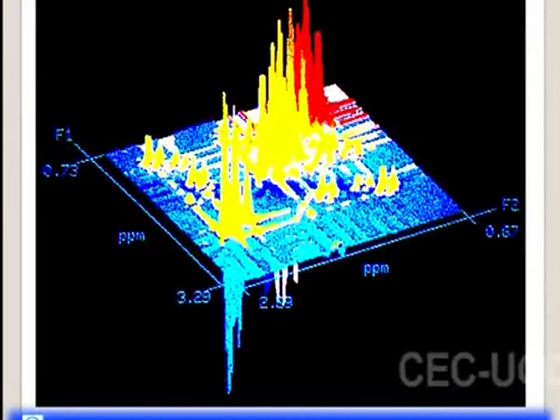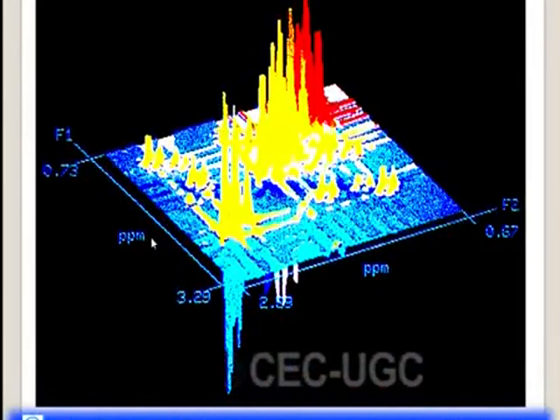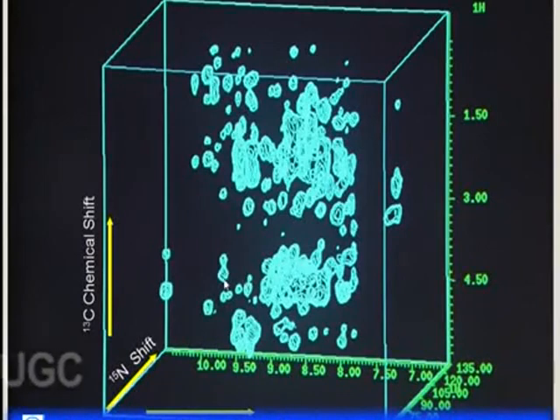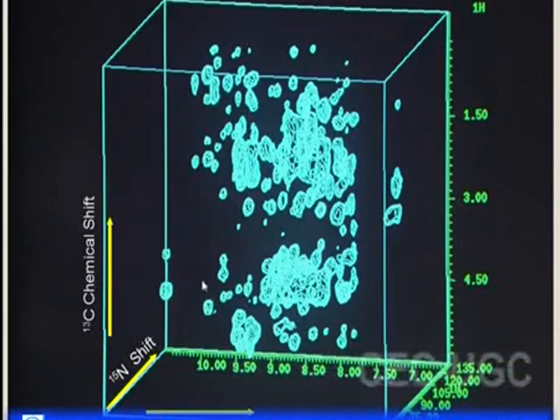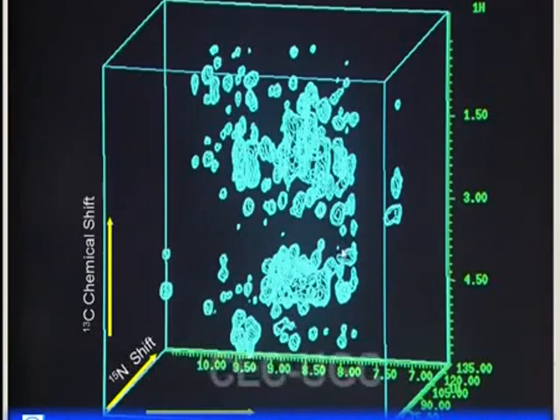And you can see this is the three-dimensional structure of NMR. This is the delta value, and this shows the intensity of a peak. We are not discussing right now the coupled spectrum of proton NMR and 13C NMR, but you can see what kind of spectrum is observed when proton NMR and 13C NMR are coupled to each other. You can see this kind of dots will be observed for a particular molecule.